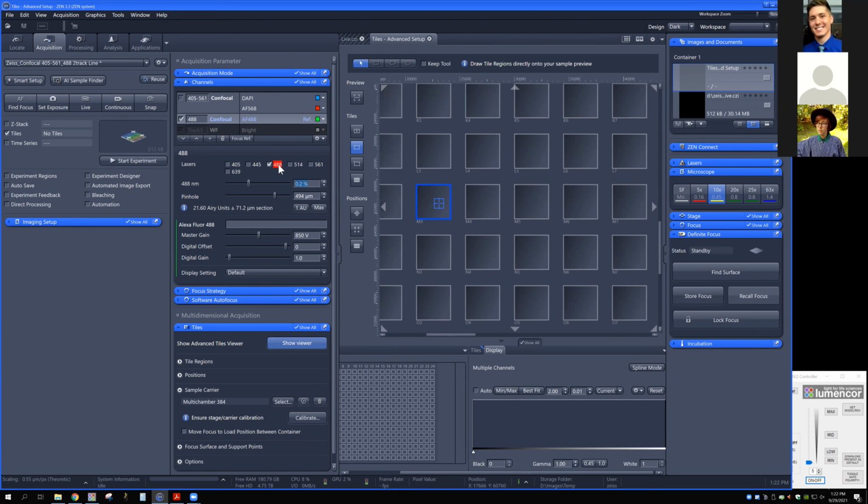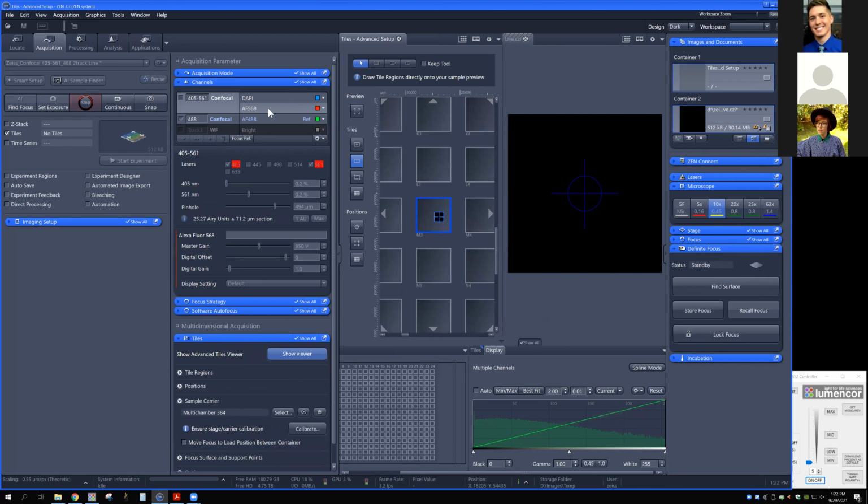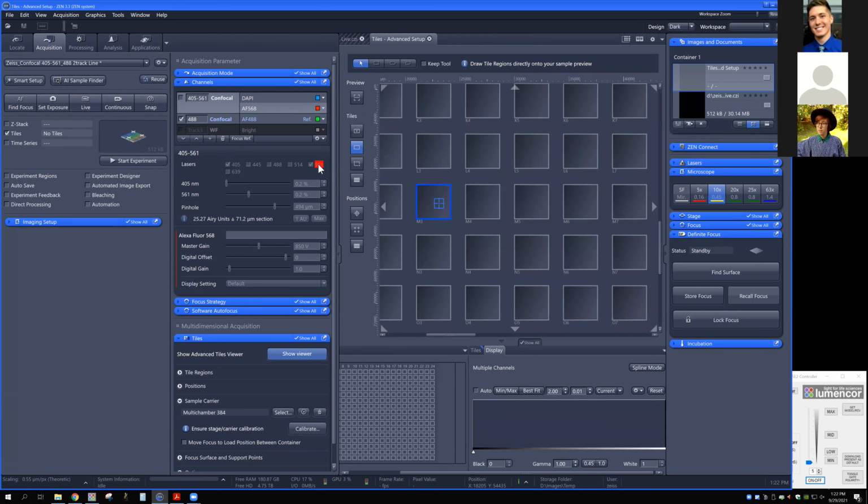We're still kind of warming up here, actually. So we did take a break and they went into standby. There we go. Not that it helps, apparently. You can see as we're starting, because we did break for lunch, that the diodes were in standby mode. So it just takes them a few seconds to start up, but we might as well just wait for them to warm up before we keep on going here.